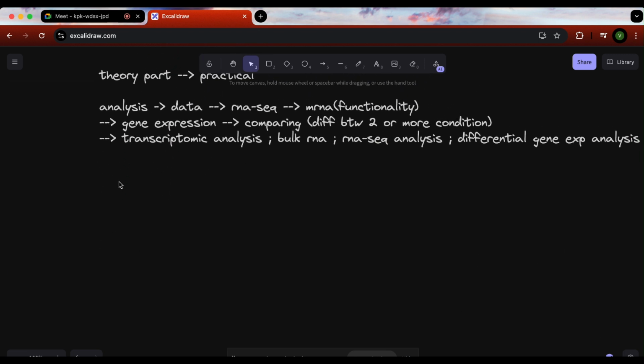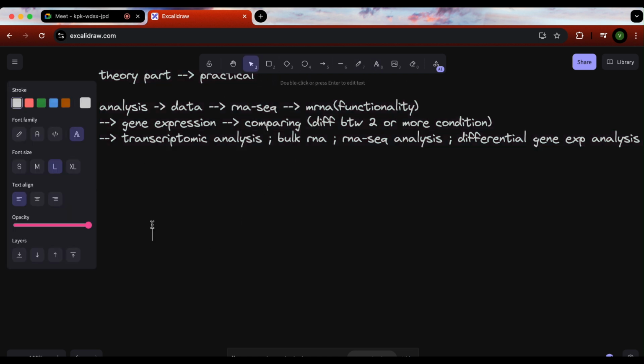Now when we start with the analysis, we need certain things. Okay, for the analysis purposes we need two things. We require data, because the analysis depends upon that data, that is raw data, and the format is FASTQ format. It means that it should have the sequencing information, that at this particular position in the fragment, the position, not where exactly it is present in a genome.